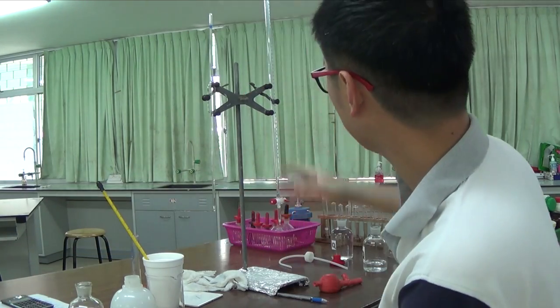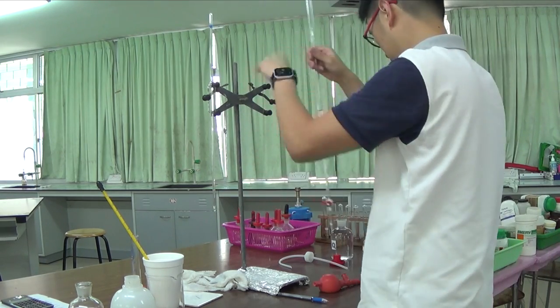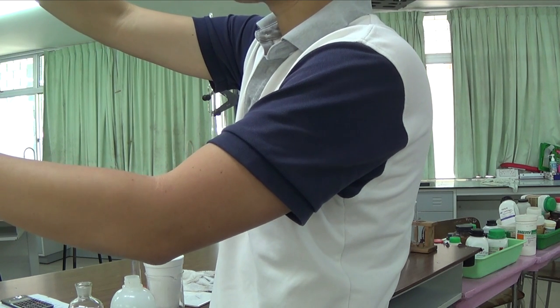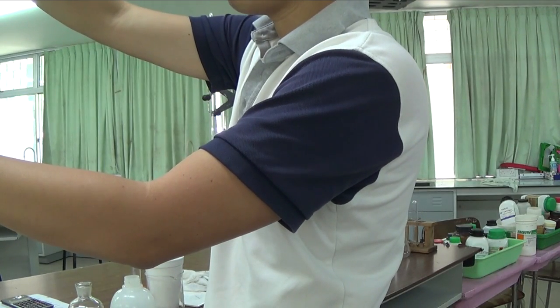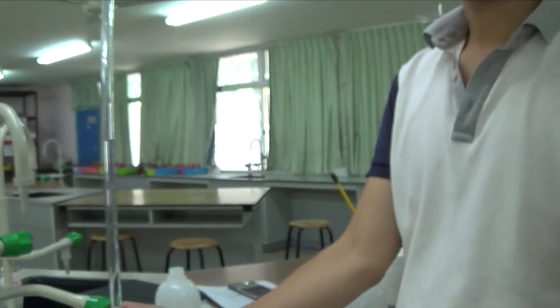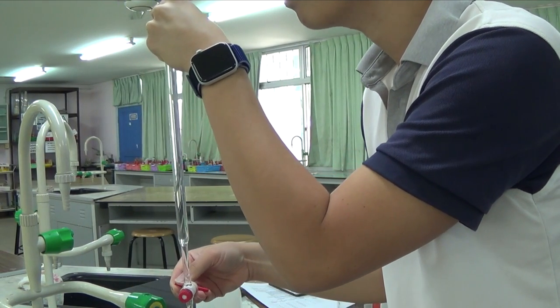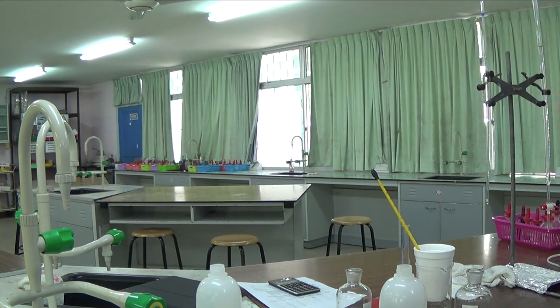And my last one is, I'm just using 25.0 cm³ Q, but I'm down to 38 here, so it's definitely not enough. So I fill the burette with Q. So always read instructions, because sometimes when you forget things, then you kind of mess up the whole thing, right? So I will not need to fill up to 0.00. I only need 25 cm³ Q, so I can fill up to just 20, because if I have 20 in my burette, 20 plus 25 is just 45, so I would overshoot it. So that's 20.00. So this time I don't need to add any water.